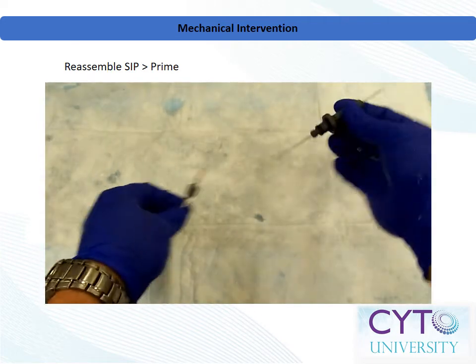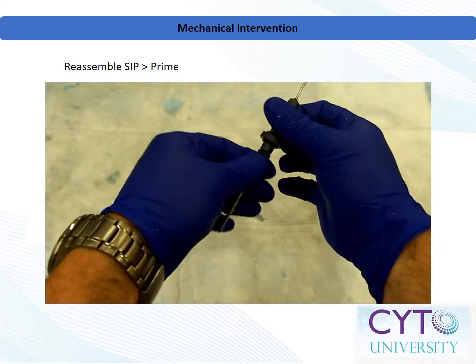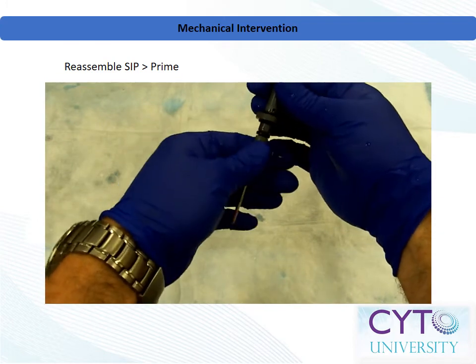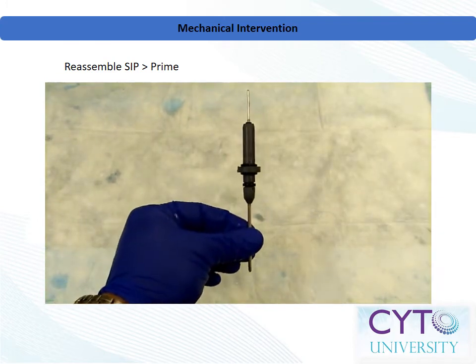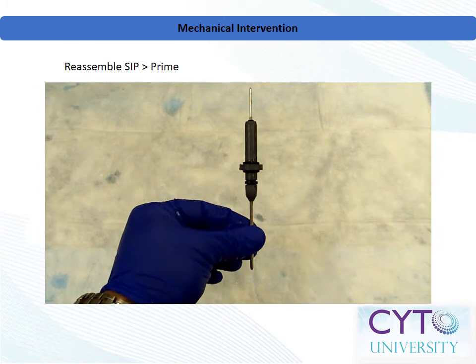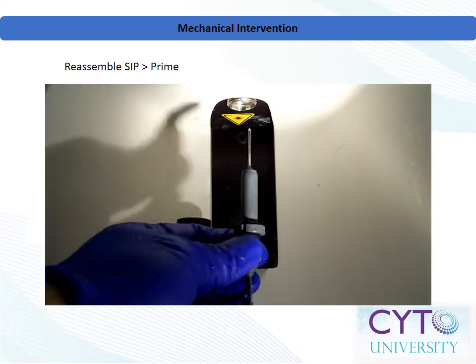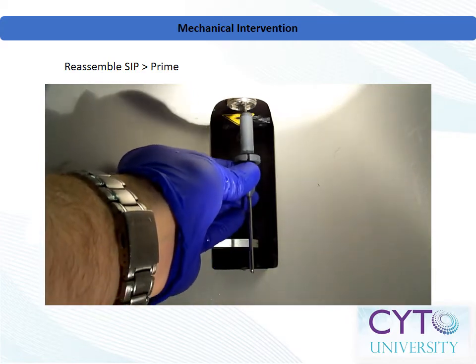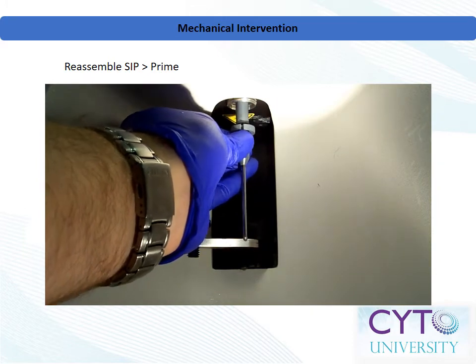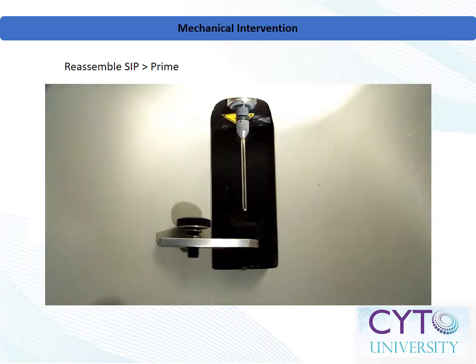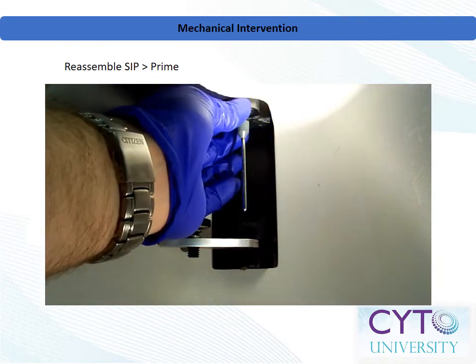Upon satisfactory cleaning of the inner sample injection tube, rinse the whole apparatus in purified water and gently dry with a lint-free absorbent wipe. Reattach the outer tube to the inner tube and tighten the cone fitting. Carefully reinsert the sample injection apparatus into the flow cytometer, taking care not to bump the end into anything as you do so. Gently push straight up until it is flush and be sure the notch aligns with the tab. Reinstall the lock ring and tighten firmly.